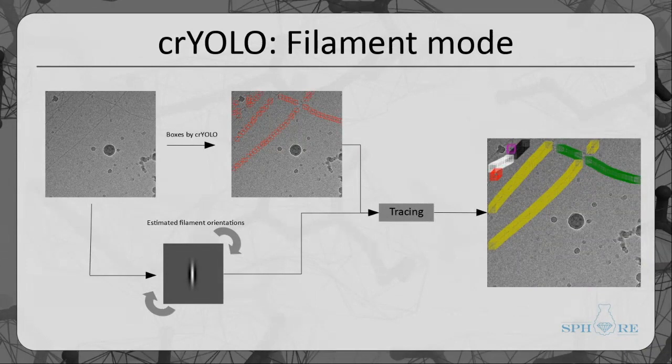All the things that I have told you now about fine-tuning a general model, about training from scratch and using the filament mode, are all described in our wiki in good detail, so you don't have to take notes.